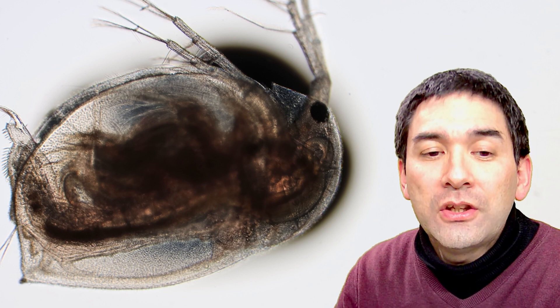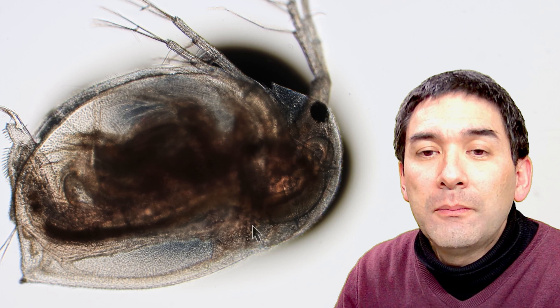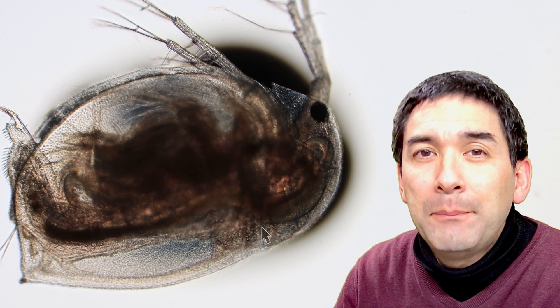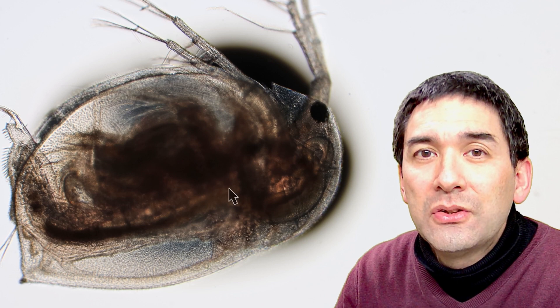And then now look a little bit at the heart. Okay, so the heart of the Daphnia can be found here on the back. Okay, so focus on this and look what happens, look what happens to the heartbeat.